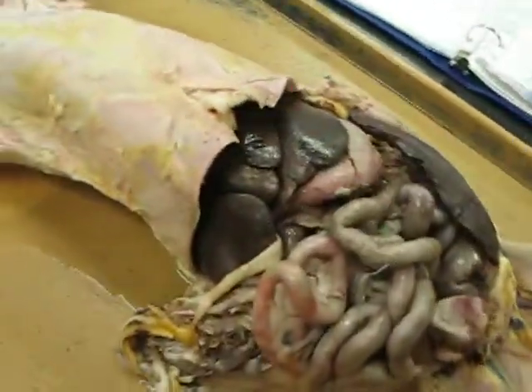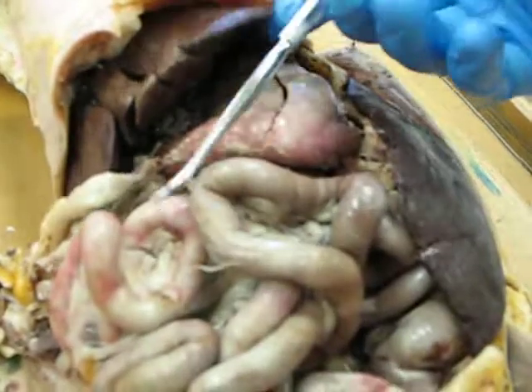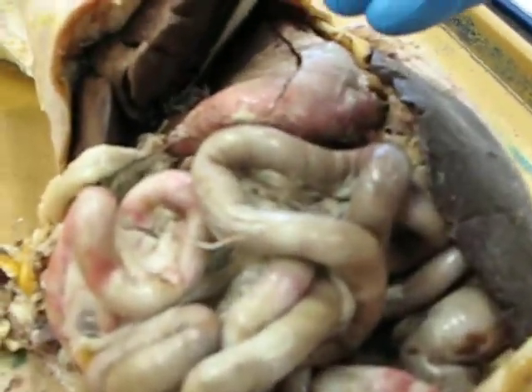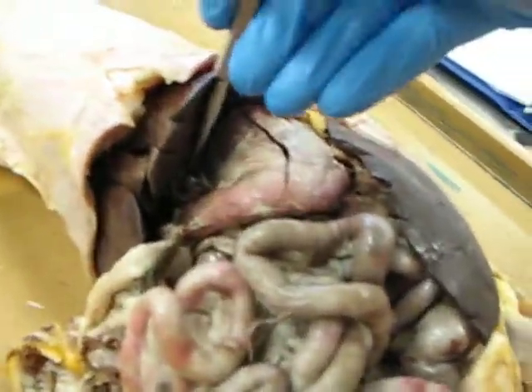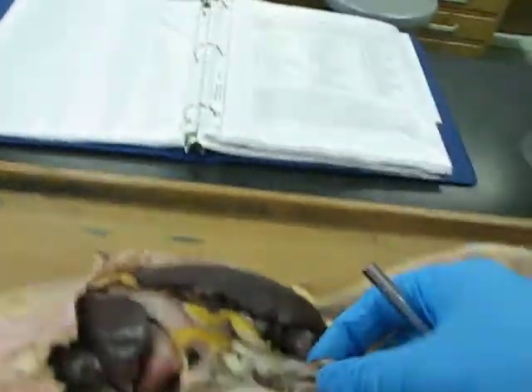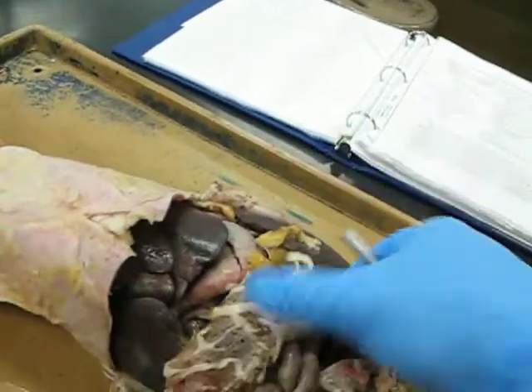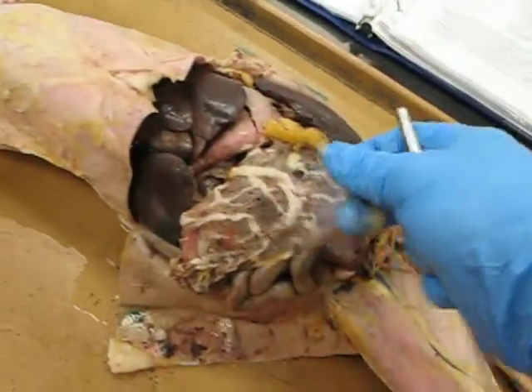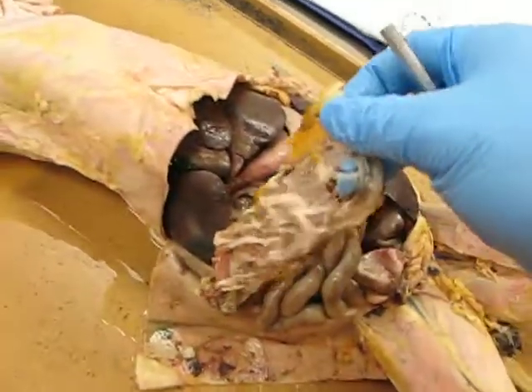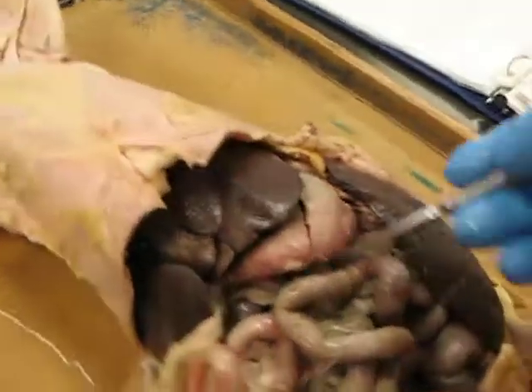If you go underneath the liver, you'll see some fine tissue here. That's the lesser omentum, and then this stuff, which unfortunately was cut off on this cat, drapes over the entire internal organs. That's called the greater omentum. This sheet, greater omentum; lesser omentum is inside.